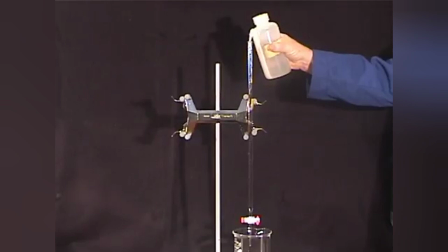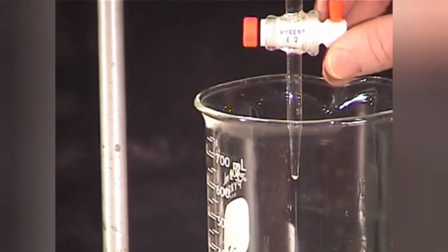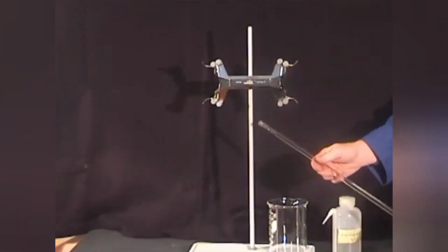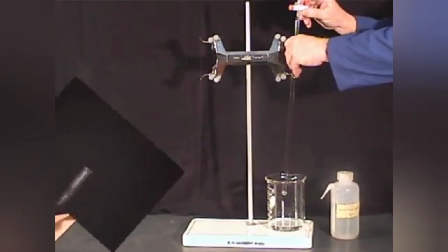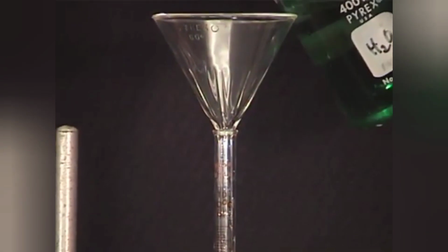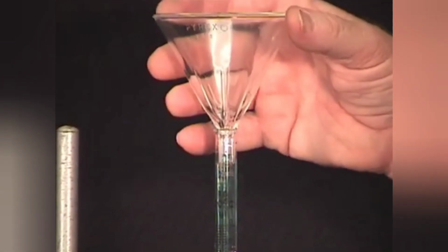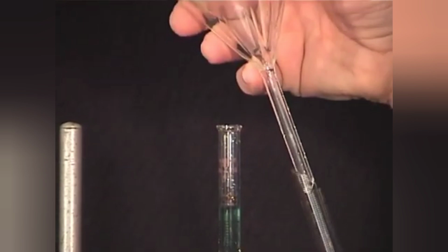The burette is a long calibrated tube fitted with a stopcock valve and nozzle. To use the burette, first rinse it with deionized water by filling and emptying several times. The rinse water must be flushed out so that its residue does not dilute the reagent to be used in the tube. To do this, use a funnel to add 5 milliliters of the reagent to the burette. In removing the funnel, be sure to clear the neck of the burette before twisting the funnel downward. If you don't, the stem of the funnel may break the glass at the top of the tube.